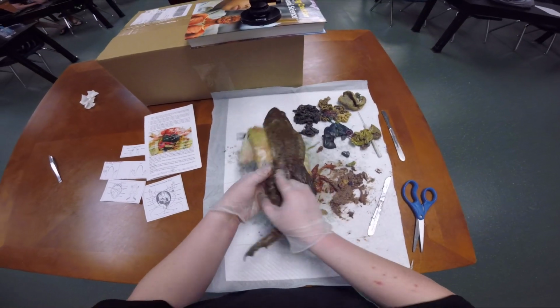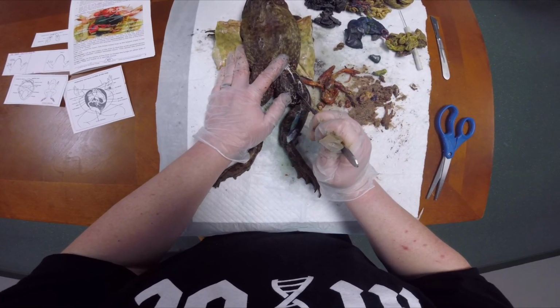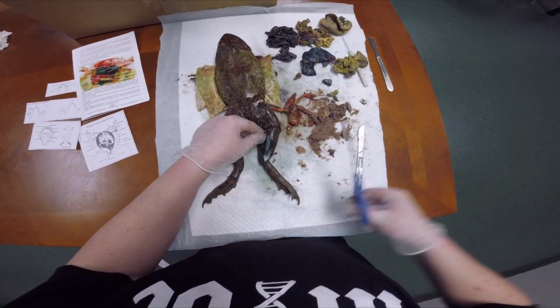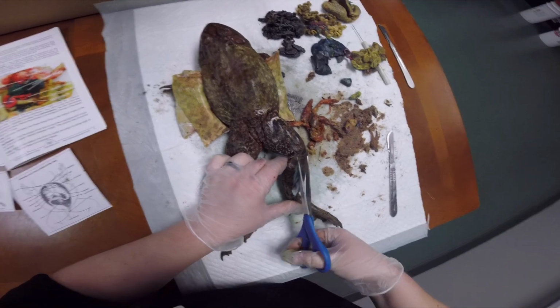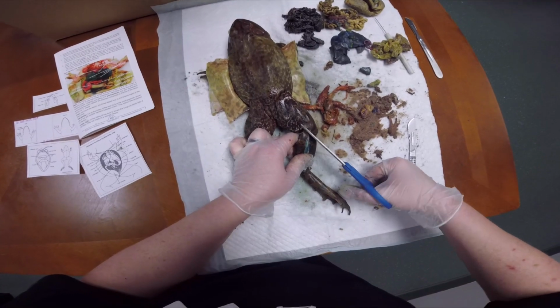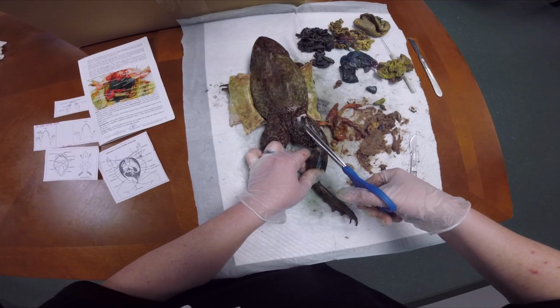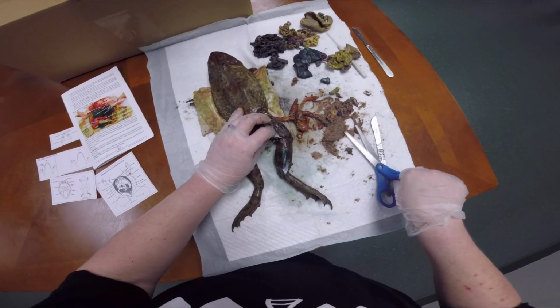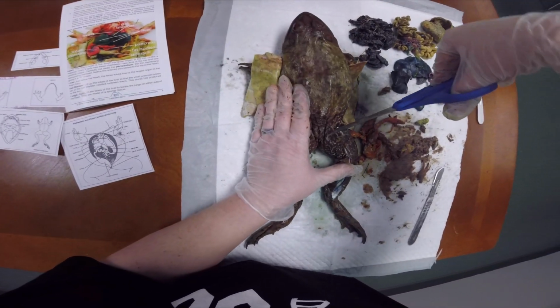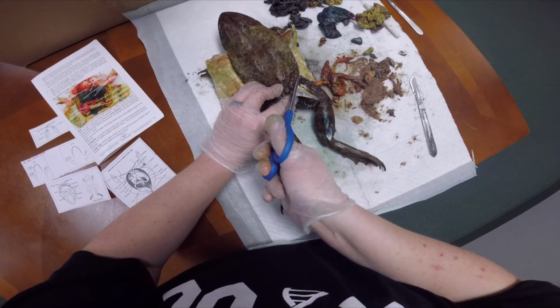So now I want to show you the thigh and the leg. So we're going to take our scalpel, we're going to make an incision, and we will probably need scissors for this because the muscle is tough. So I'm actually going to cheat a little bit here and cut with the scissors. So you might know frog legs are a delicacy in many places. People like to eat them. So this one would be a good one to get fried up for you. Put on your table. Should have made that for your chopped challenge.